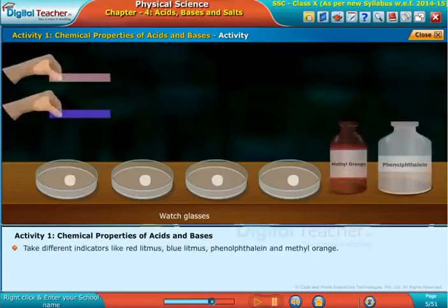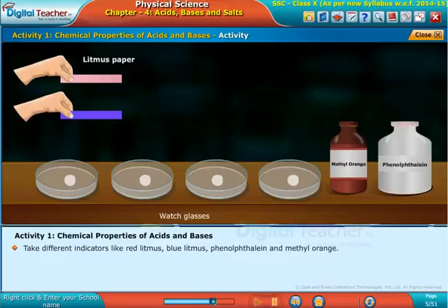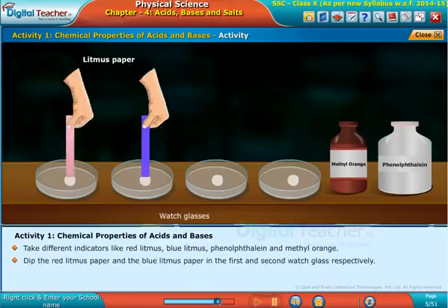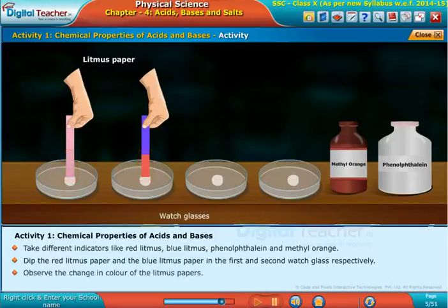Take different indicators like red litmus, blue litmus, phenolphthalein, and methyl orange. Dip the red litmus paper and the blue litmus paper in the first and second watch glass respectively. Observe the change in color of the litmus papers.